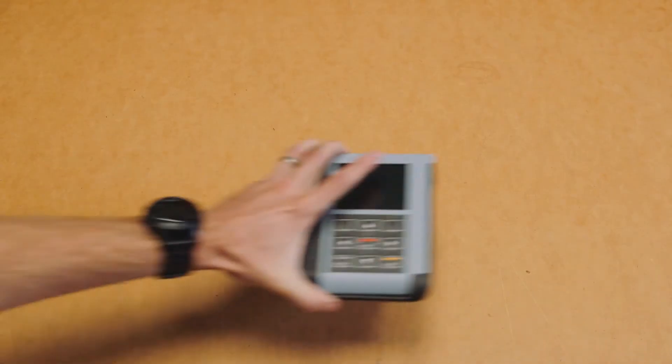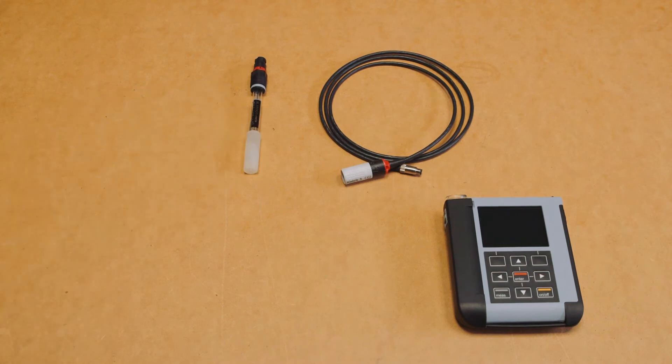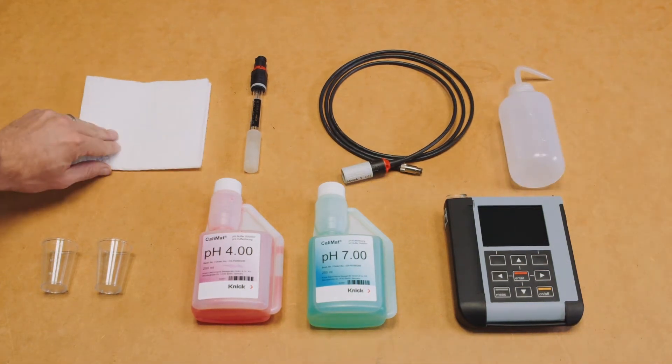Now let's take a look at the items we need to perform our calibration. To perform a calibration you will need the Portavo 907 Multi Portable Meter, a MemoSense Portavo cable, a MemoSense pH sensor, at least two buffer solutions with clean containers to pour them in, rinsing water, and finally a clean cloth for drying the sensor.